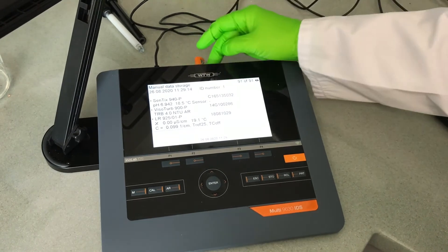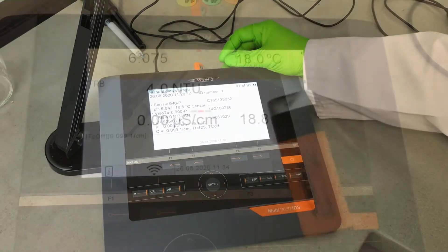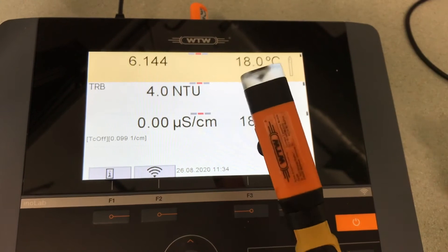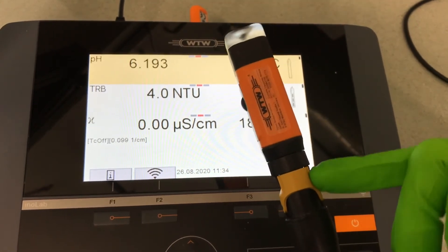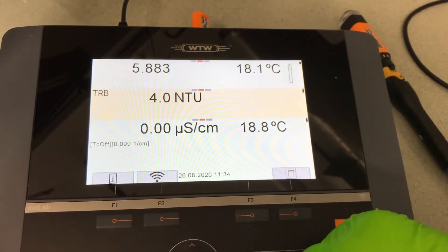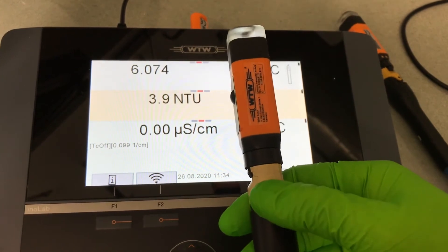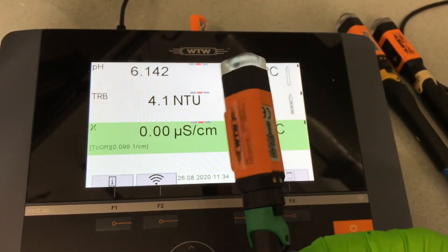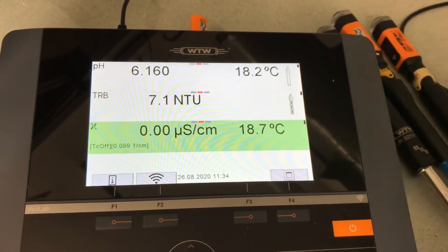Data can then be transmitted, or you've got USB ports in the back where you can store the data and then put it into Excel. To identify and make sure which probe is which, we use color coding. You can see we've had this beige color displayed for pH, and that corresponds to the little clip on the top of the probe. So we have pH — if we move that probe to one side and select turbidity, turbidity has a similar color, but gives you an idea. And then finally conductivity — green — and we have a green connector here. It's a way for each individual person to easily remember which probe is which.